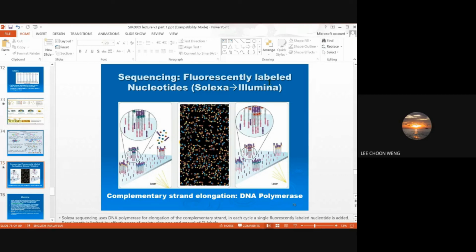Okay, so next we go for the Illumina platform. Okay, previously known as Solexa. Okay, I think it was bought up by Illumina. So here the polony, the clonal amplification, bridge amplification allows the same DNA sequence to group together at one spot. Okay, so each will be grouped together so that when you're carrying out the sequencing by synthesis, you can see the color clearly.